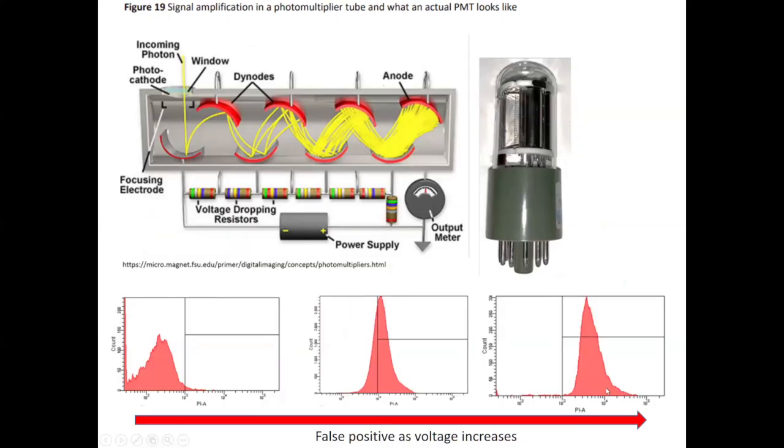And this is very important. Once it happened, very early, when I was using flow some 12 years ago, my technician, I was eagerly waiting for a signal for one particular marker tagged to the fluorochrome APC. He saw that it was coming negative. I asked him to repeat. So what he did, he slowly adjusted the voltage of that particular APC channel, that is the APC detector. Because of this high voltage input, the amplification is more vigorous. So though there is no signal, which is noise, now the noise is amplified because of dark current, and it can mimic a positivity, but actually it's not, right? So you should be very careful when you're working with flow.